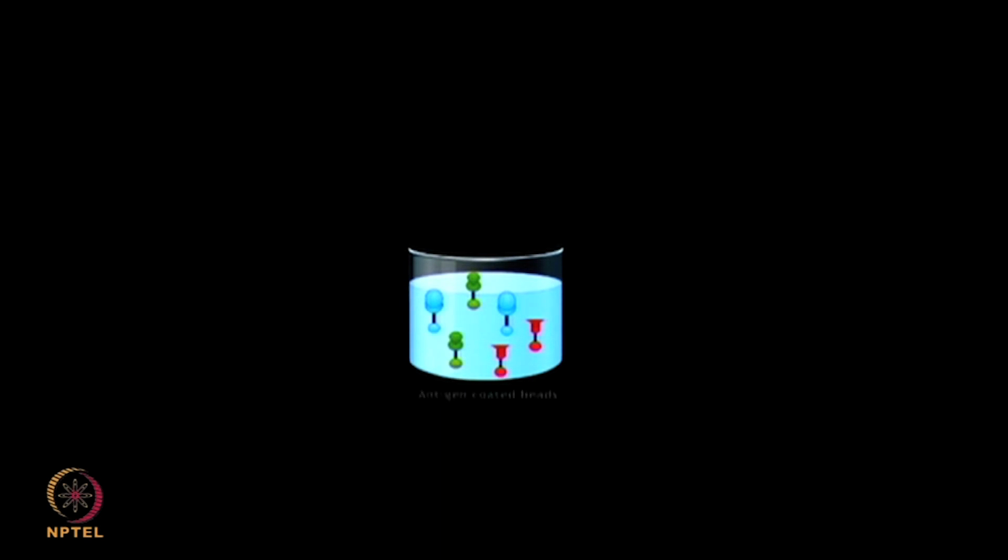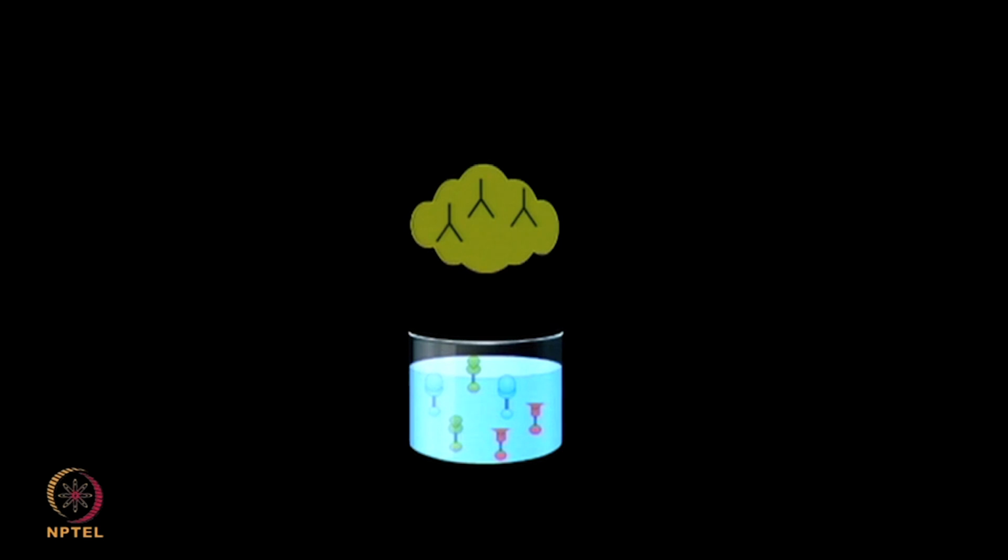After mixing the beads together, the serum was added to these coupled beads and human IgG were detected by probing with the enzyme linked anti-human IgG.